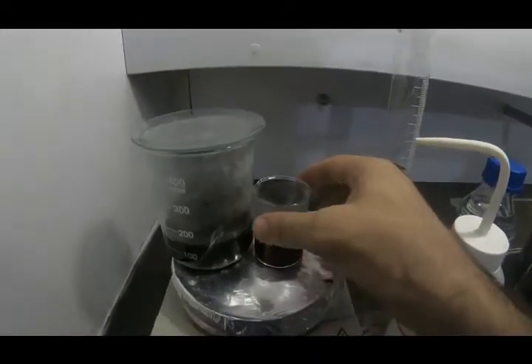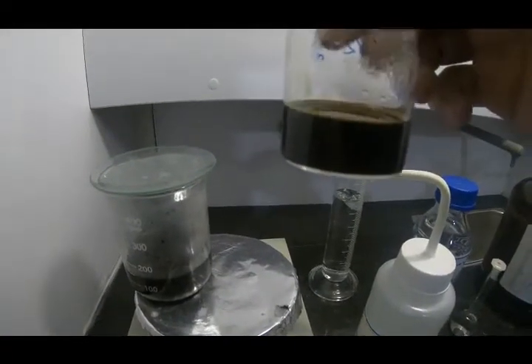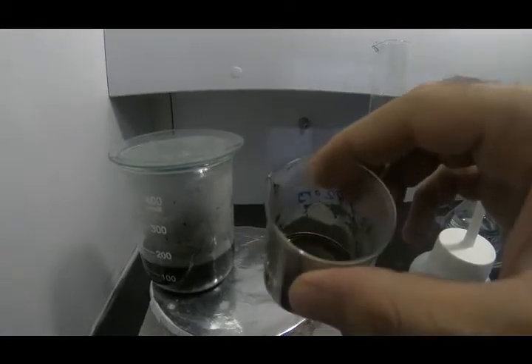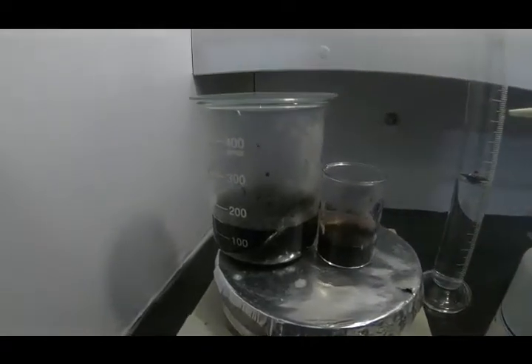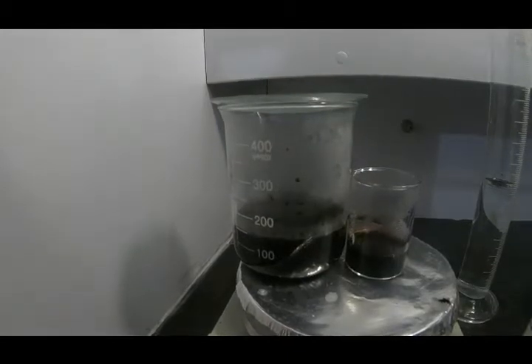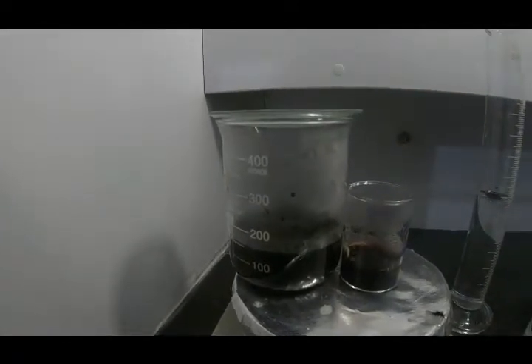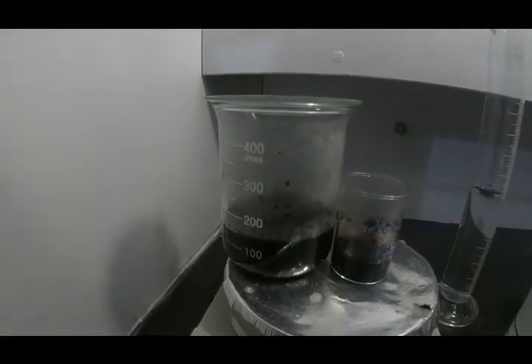Okay, I dissolved palladium chloride in water and concentrated HCl. It was a pain to get this to dissolve, but it eventually dissolves if you heat it. And I added around 150 milliliters of water to the carbon. Now I will leave them to get to around 80°C, and when they do, we just go ahead and add the palladium chloride to the carbon source.